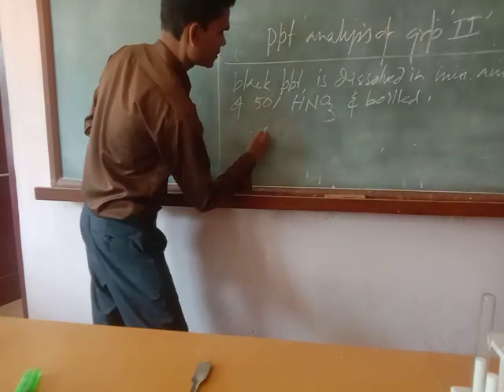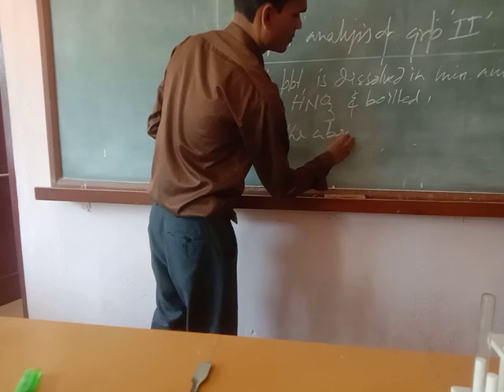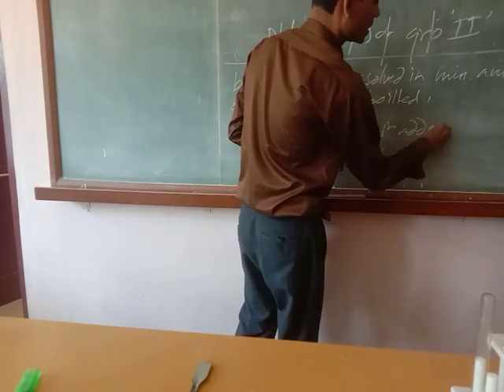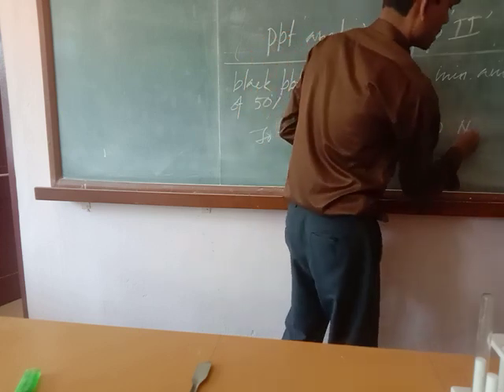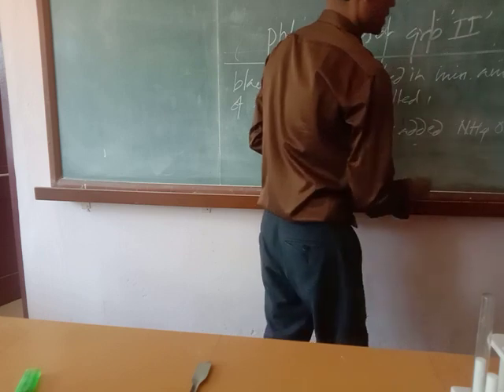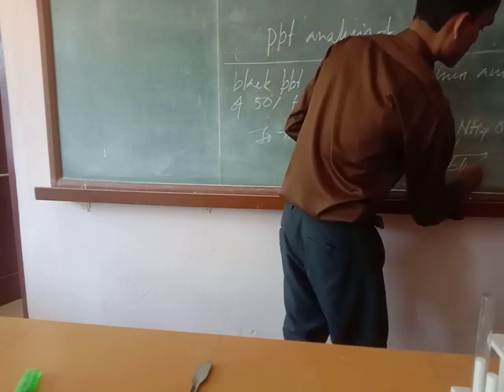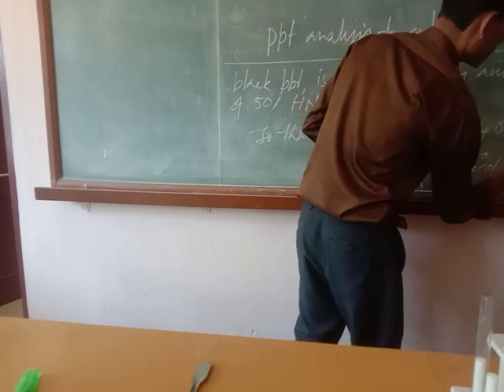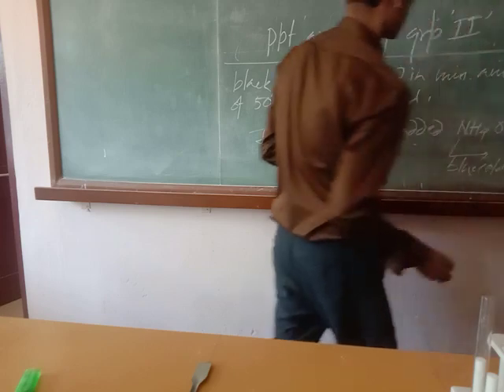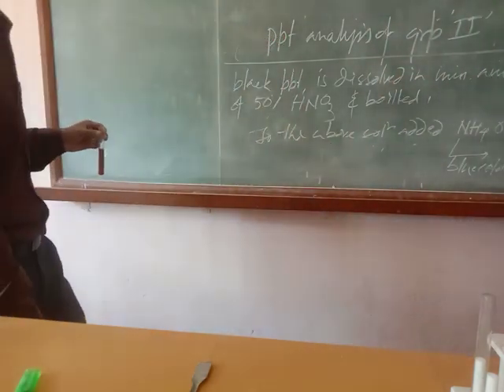To the above solution, we added ammonium hydroxide. Then you observe blue coloration, and it indicates copper. Clear?